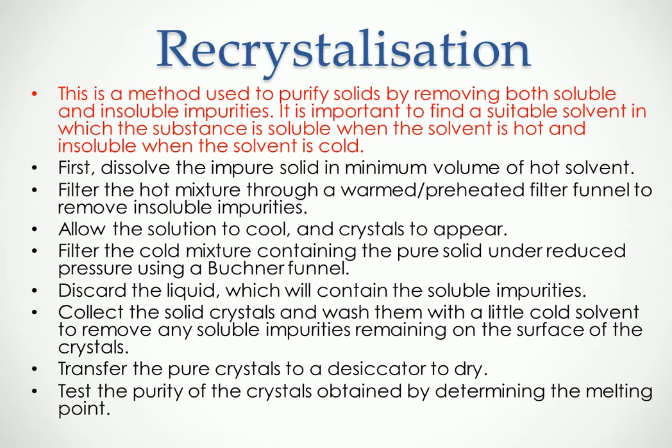Second of all, we need to filter the hot mixture that we obtained, but it has to be through a warmed, preheated filter funnel to remove the insoluble impurities. It is also important that we use a warmed filter funnel to prevent the solute from crystallizing and blocking the funnel. So after doing so, we're going to allow the solution to cool and for the crystals to appear.